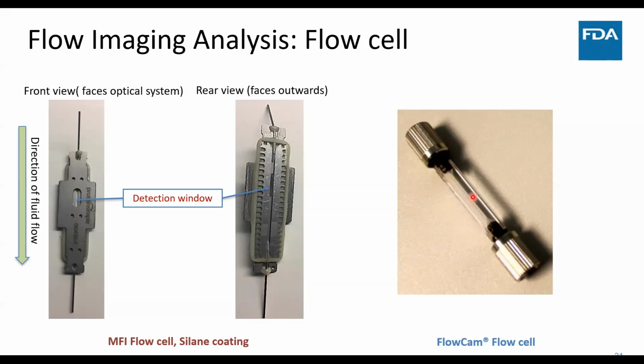This has an outer membrane, but in there you see a much thinner flow cell where we're taking our images. One thing I want to point out is all these manufacturers have different sizes of flow cell. As you change your flow cells, because we have a camera system, it would impact your field of view. That means it would impact your efficiency, or the percentage of your total fluid volume that you are taking images of. So if you are changing your flow cell, it might require calibrating the instrument.